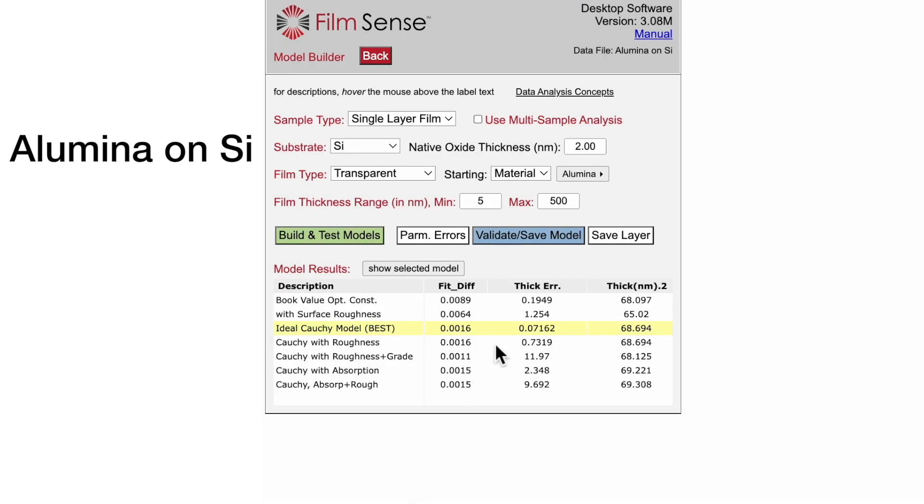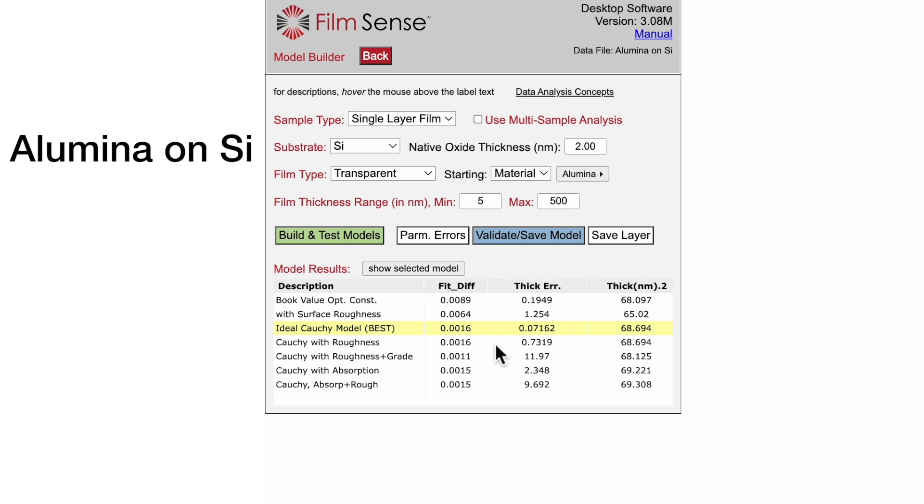Model Builder uses a combination of the tabulated fit diff and thickness error values when selecting the best model. For example, the more complex Cauchy with Roughness plus Grade model has a lower fit diff compared to the best model, but its thickness error bar is much larger.